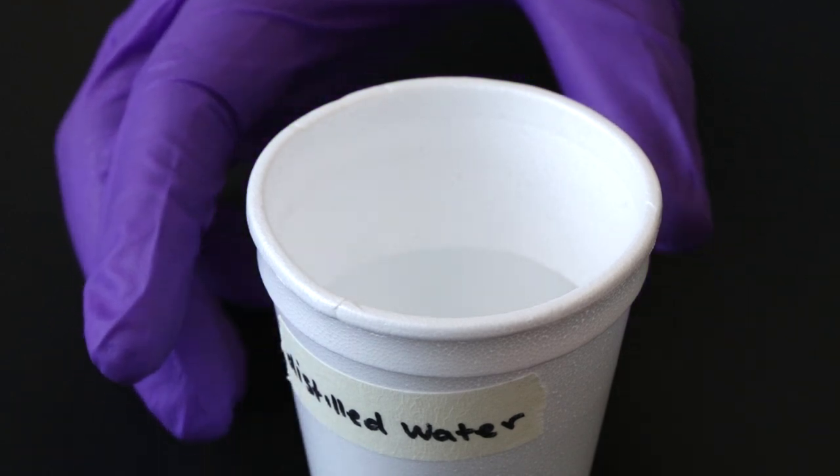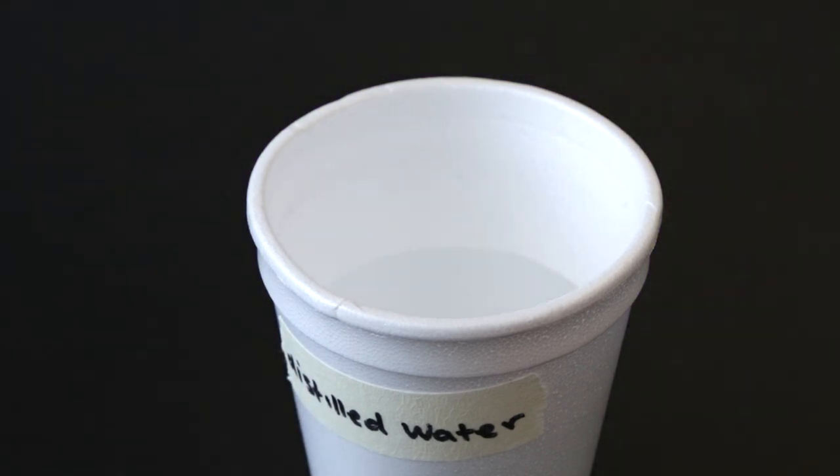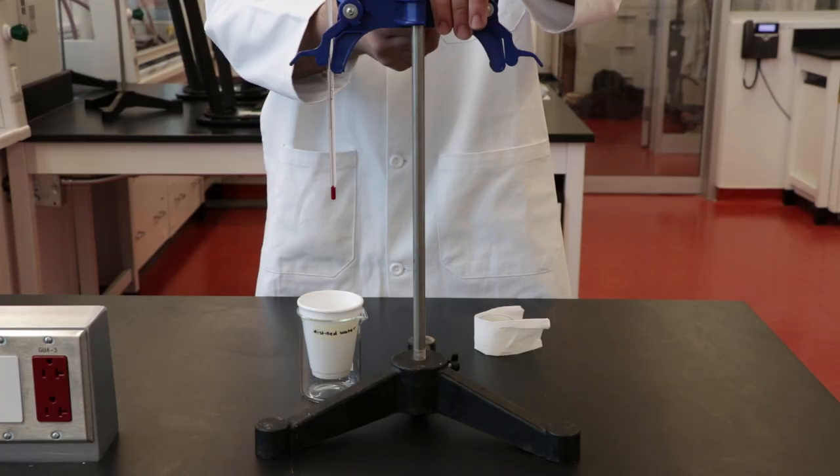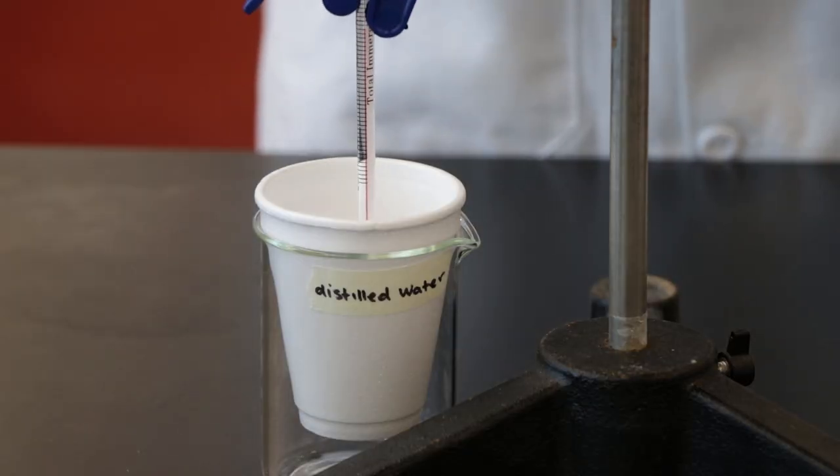Measure 100 mL of distilled water into the styrofoam cup using a graduated cylinder. Repeat the procedure from part one and measure the temperature of the distilled water for four minutes at one minute intervals.